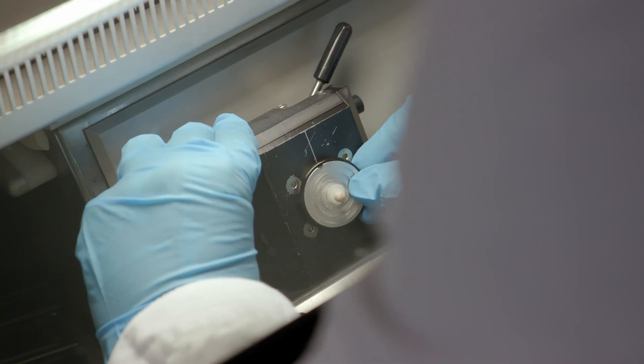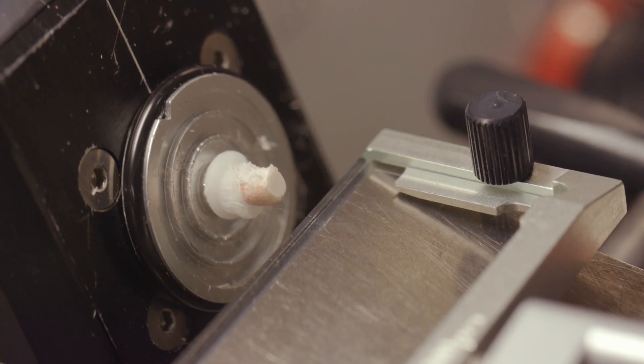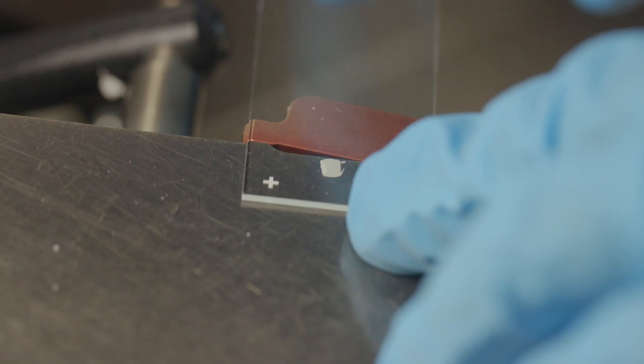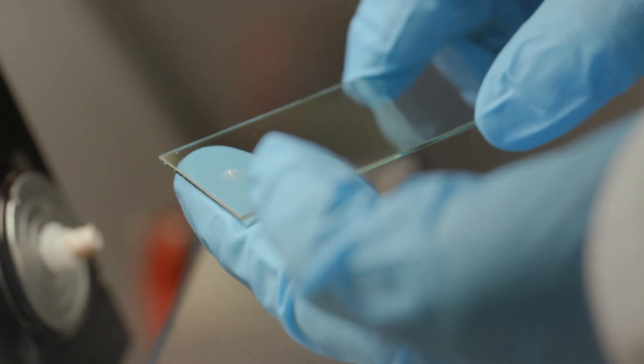We've had the chance to get some insight into the new TIMSTOF Flex. I was very impressed by the capabilities that are emerging for lipidomics. The TIMSTOF Flex offers a lot more specificity because of the trapped ion mobility capabilities of the instrument.